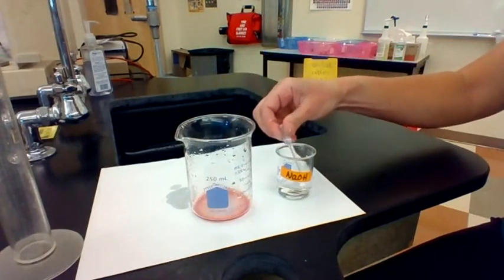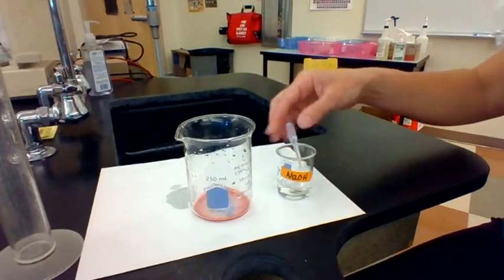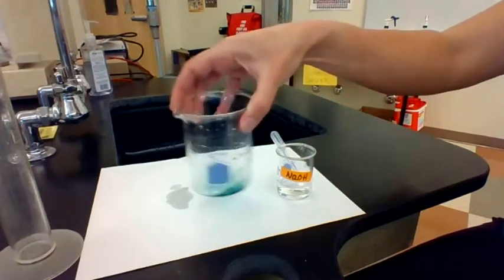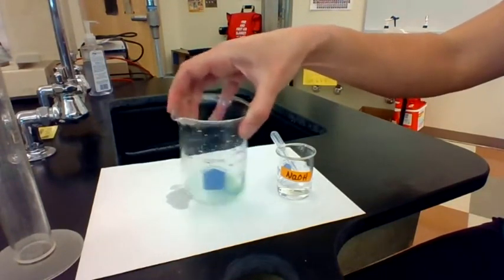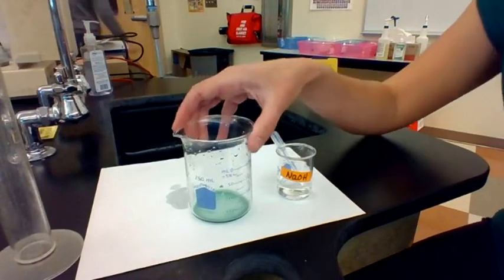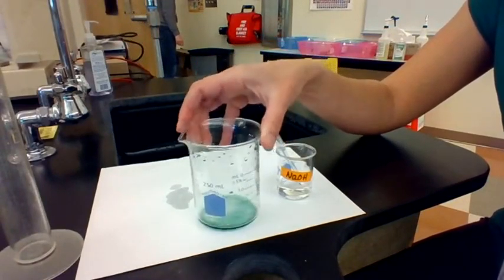So I've added 10 drops so far. This is 13 drops. Oh, and look at that, at 13 drops, there we go, the pH turned to neutral. So the pH changes much more rapidly when you're adding sodium hydroxide than adding water. That's because you have this chemical reaction occurring. And now we have neutralized our sample.